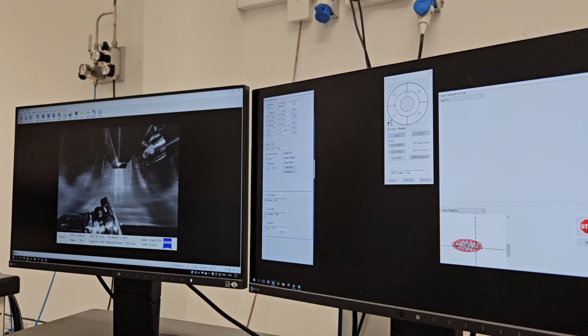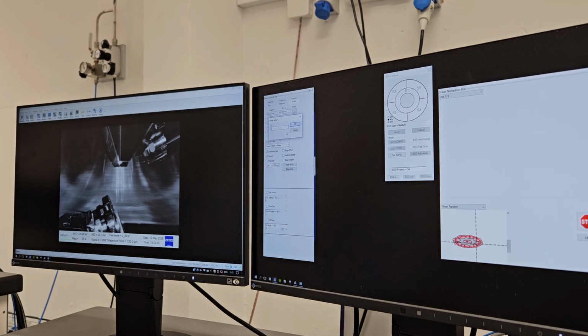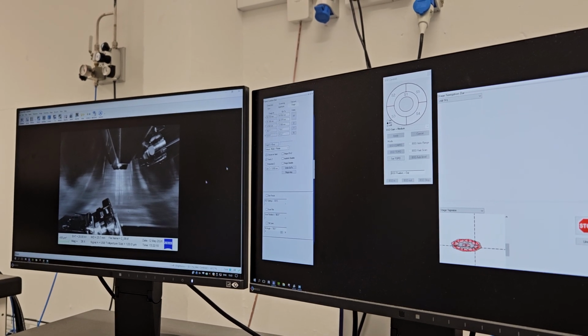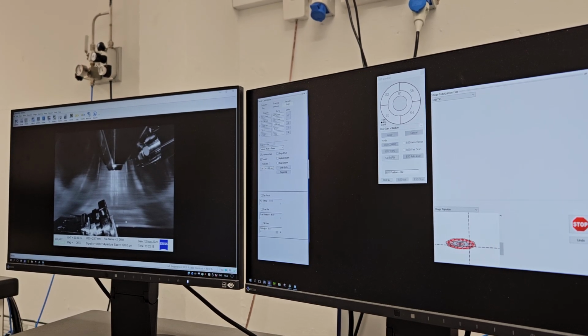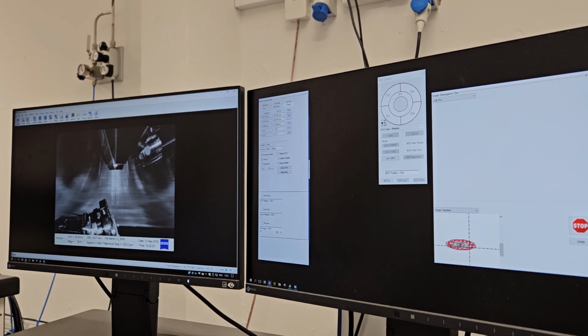70.5. Okay, so this is now 66, you go to 70. And do this only if there is enough space. If you have big samples, you might not even have this space. So this sample is very flat, therefore I have a lot of room.